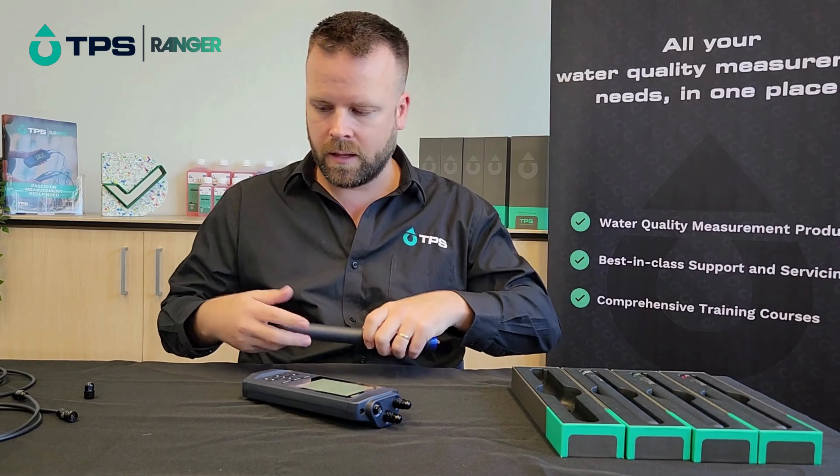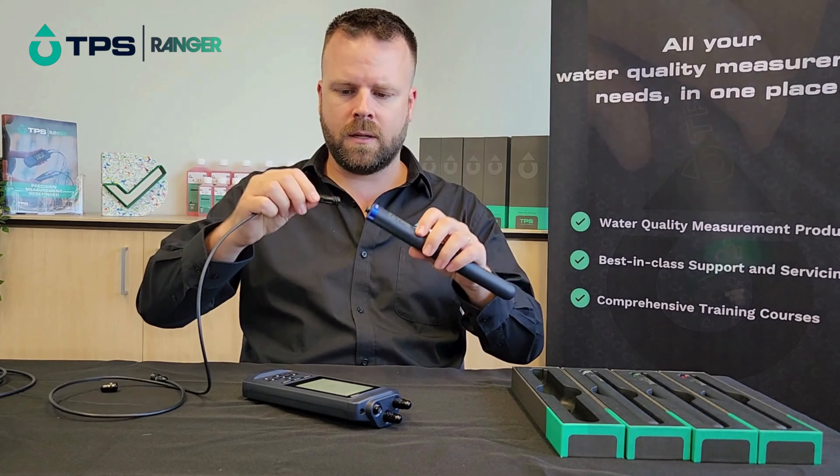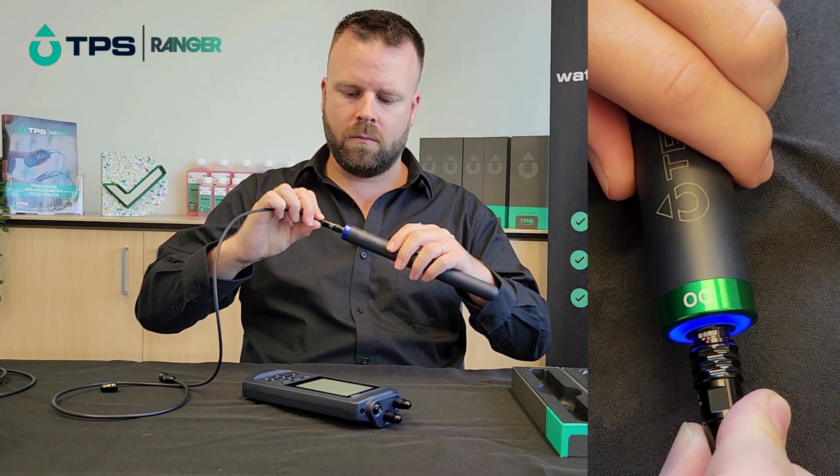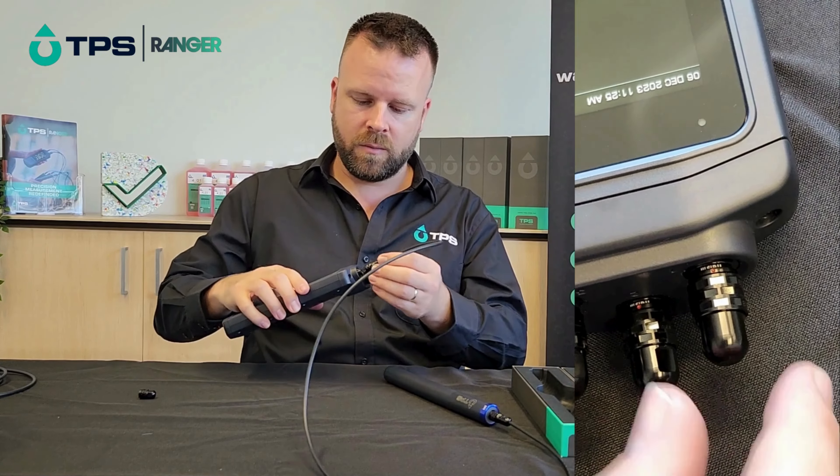So take them off and choose the sensor you're going to use. I've got all the sensors here and I'm going to take out the pH sensor. All you have to do is connect up the cables and then go ahead and plug that into the instrument.